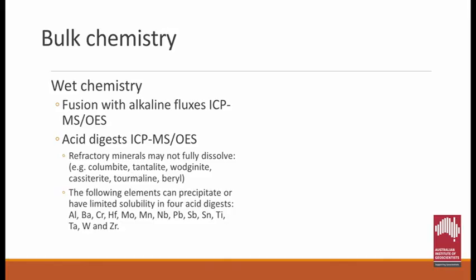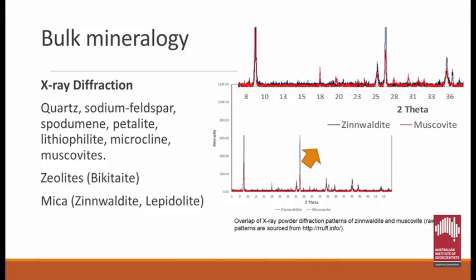Yeah, you can do lithium analysis on pretty much all geological material. It could be soil, rocks, and vegetation. Yeah, so it's very standard procedures. X-ray diffraction again. If you want to understand the mineralogy and where the lithium element is actually locked in, most of minerals that are associated with lithium can be clearly identified in X-ray diffraction analysis.